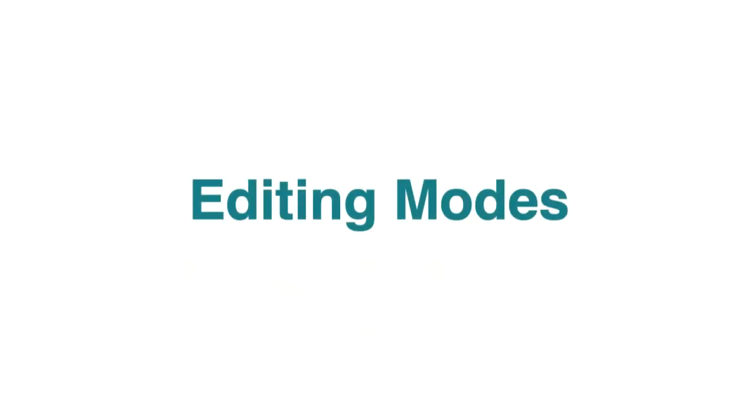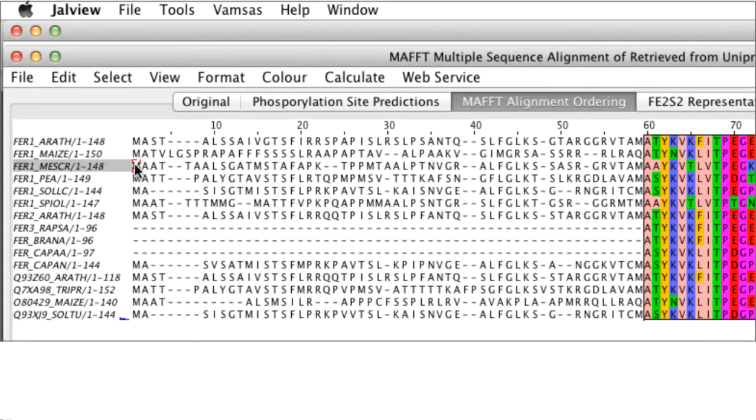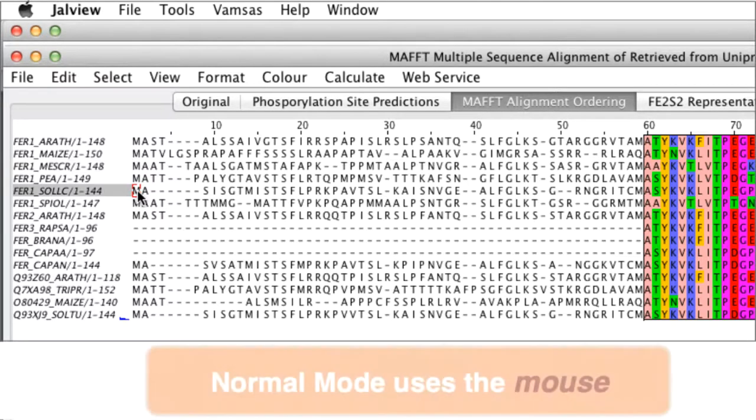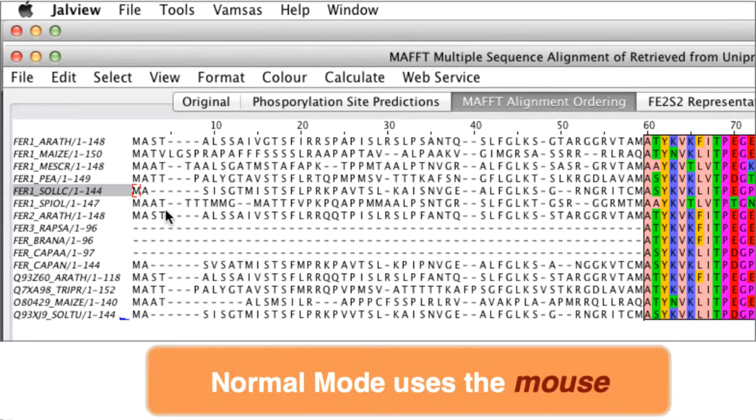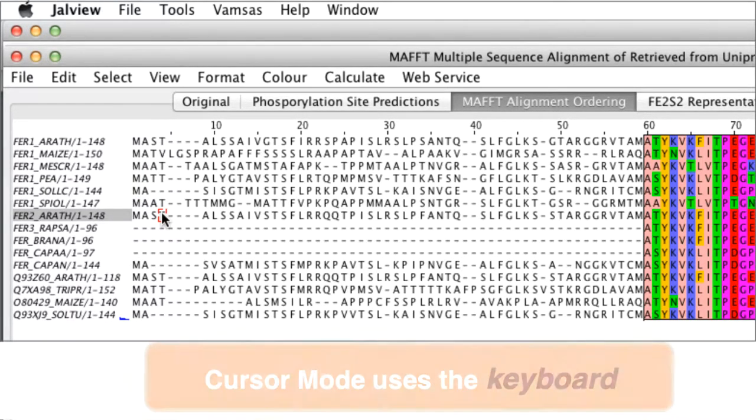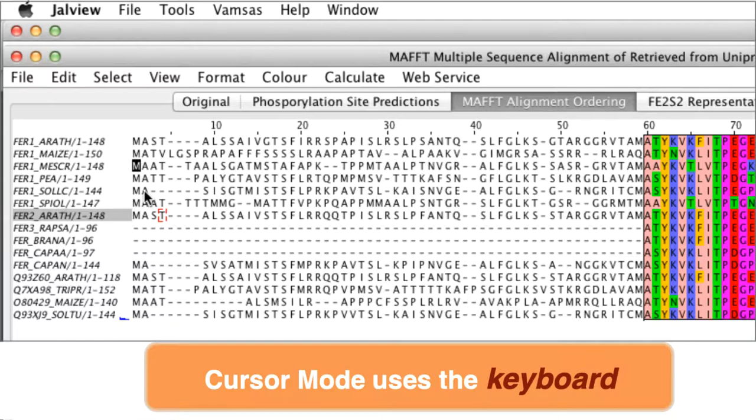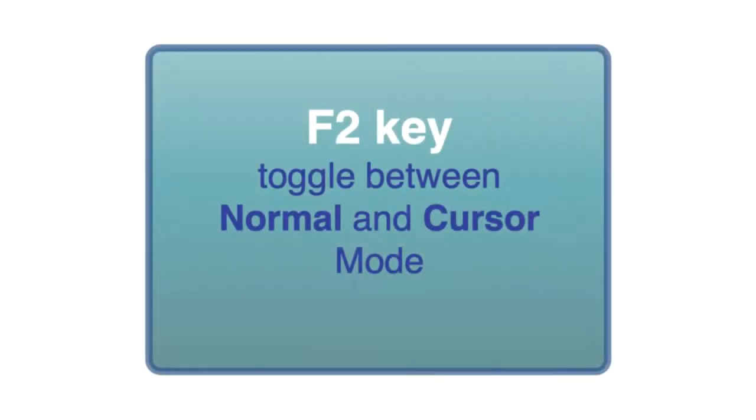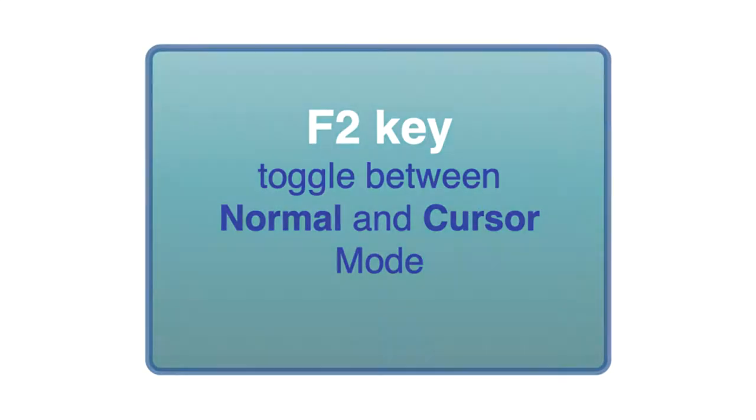Jalview has two navigation and editing modes for selecting sequences and residues. There is a normal mode where you input your instructions via the mouse and there is a cursor mode where you enter the commands via the keyboard. Function F2 key on your keyboard toggles between these two modes.